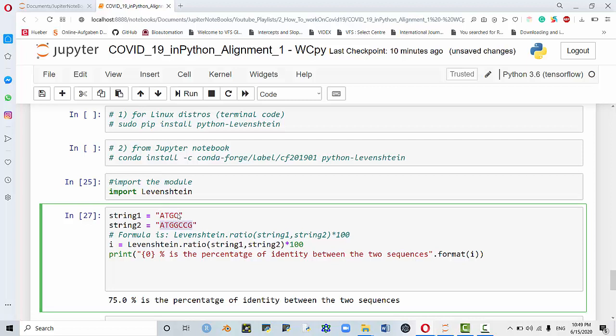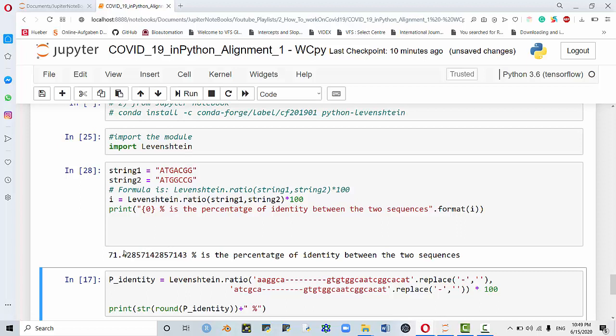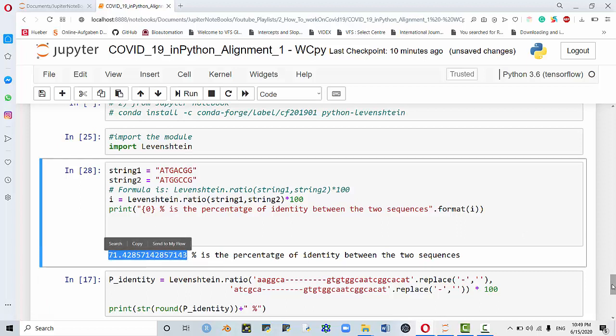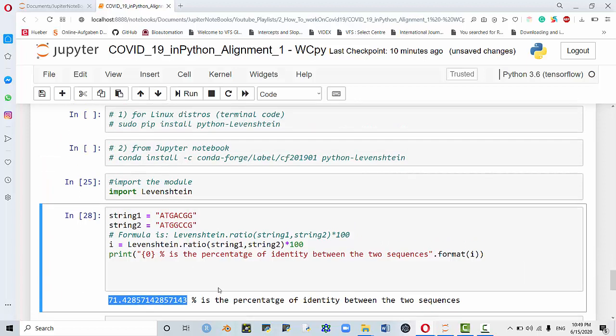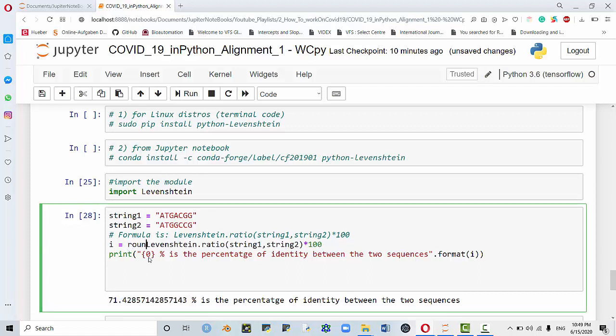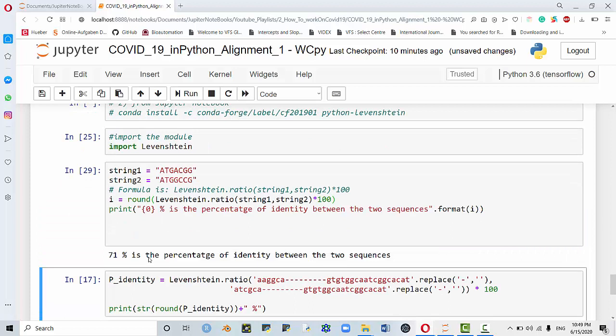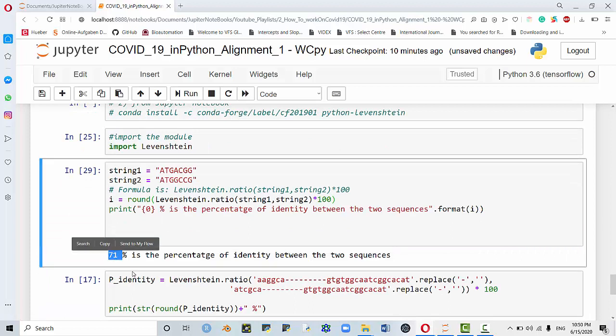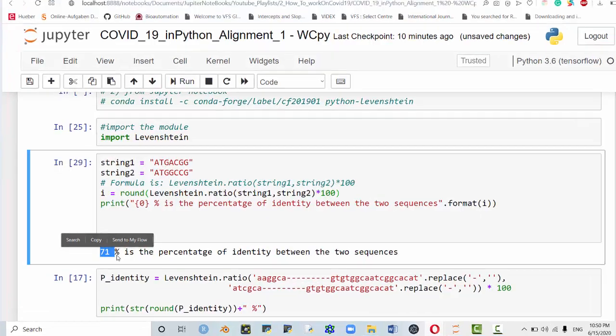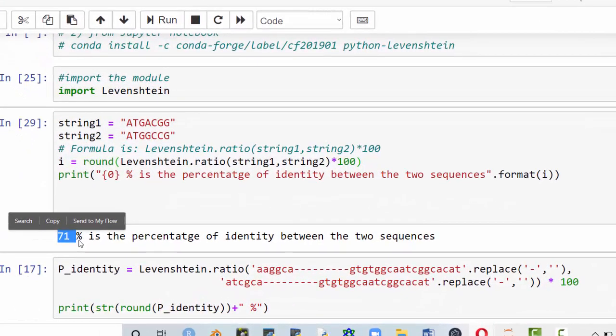With a similar thing, I will tell you that this is the percentage of similarity. It's 71 point blah blah blah. However, you can round this up. You could say round, and I will show you the rounded up percentage value if you are interested in rounding it up.